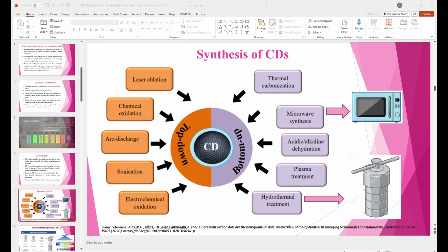And then you put the chamber cap, and then you have to put the synthesis reactor disk. One goes at the bottom, and the other goes at the top. If you forget to put either of the reactor disks, what happens is that this is made of Teflon.